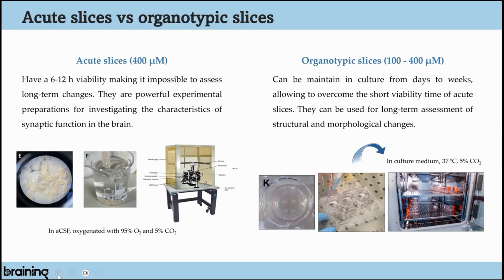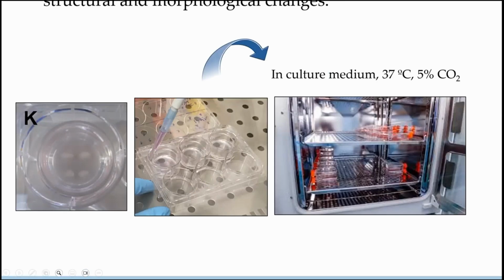As you can see in these images, I have slices in an insert. These slices are put in inserts that are then placed on a 6-well plate, and then they are incubated at 37 degrees with 5% CO2 in culture media, in a culture incubator.